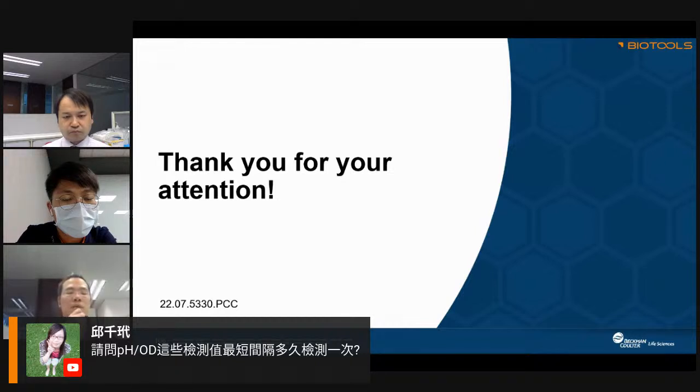The fastest speed is 3 minutes for each parameter. In general, we're using the 6 filter model, which is the maximum number that we can put into the XT. So that will be 3 times 6, which is 18 minutes.